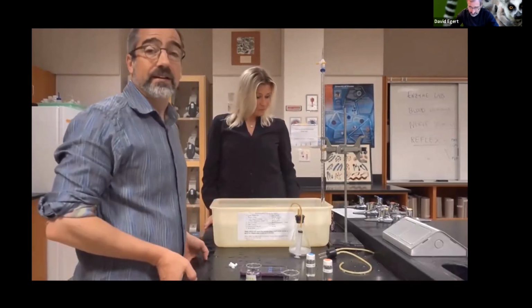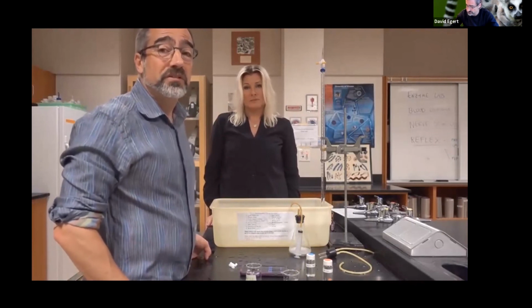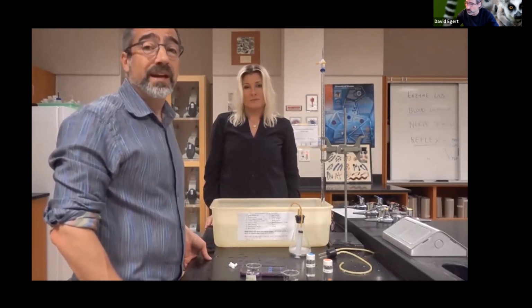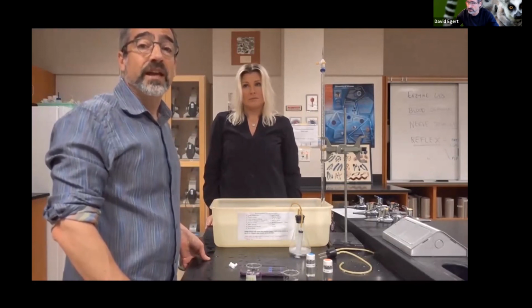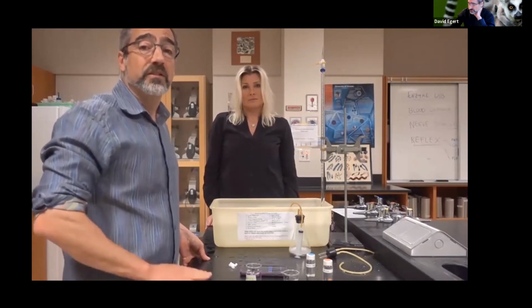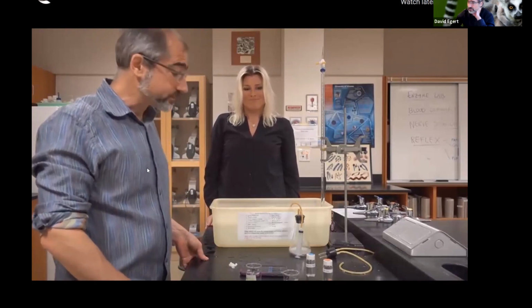We also hit 90 seconds there, which is typically what we're interested in, when the reaction is really rolling along. In all the cases we're going to be doing, 1.5 minutes in, you're on the tail end of the reaction anyway, even if there is still a little bit of oxygen being produced. So usually at 90 seconds, you can call it and move on to the next trial.